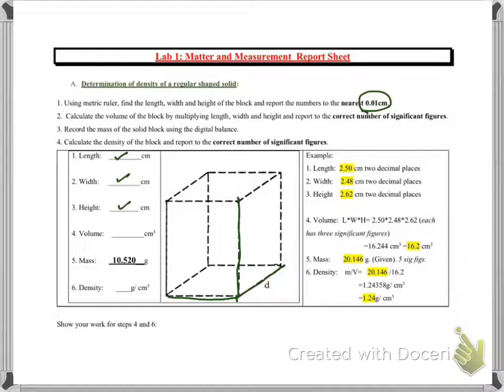And I'm giving you an example here. And so it has to be 2 decimal places. If you're writing just 2.5 or 2.4, that's wrong. 2 decimal places, 2 digits after the decimal. Once you have your length, width, and height, ignore this D.